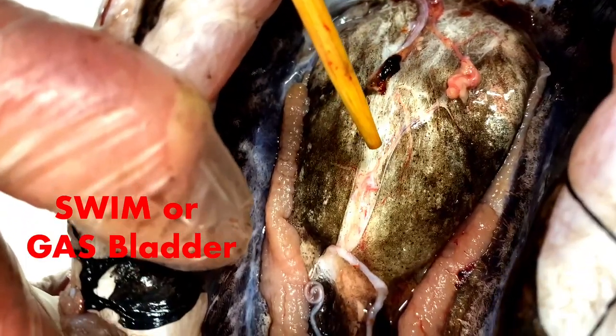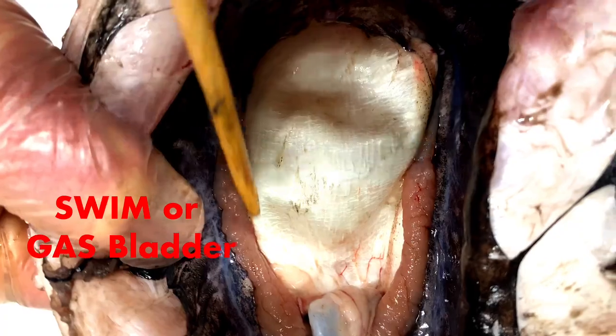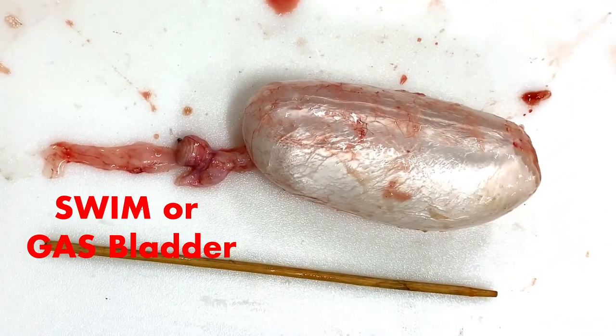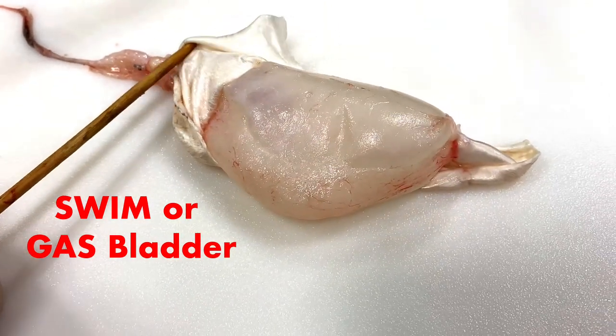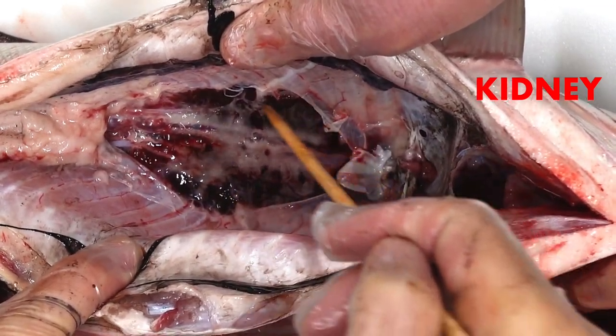One of the interesting things about the carp's gas bladder is that it actually has three layers of tissue. To see the kidney, you must remove the external layer of the gas bladder.